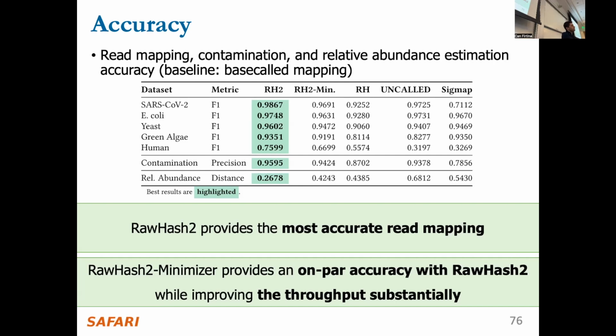I'm not sure if the hashing is going to help you with the repeats, because they should hash at the same place. The question is, you have long reads, and the long reads should help you with repeats. But you're looking at little pieces of the long reads, which is throwing that away. So how can you take the repetitiveness and say, wait a minute, we have something that's a megabase away? Can we use that?